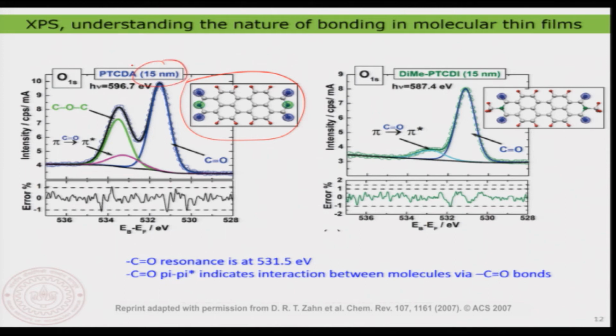You remember that time we were looking at the valence band electronic structure of the same molecule in a 15 nanometer thick film. And here I am looking at the same film, but I am doing the XPS, to look at how the molecules are interacting. Yeah, that is the interesting thing.